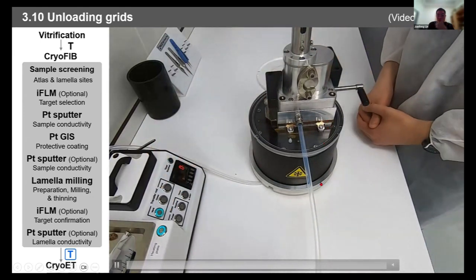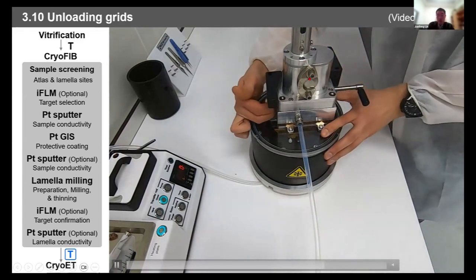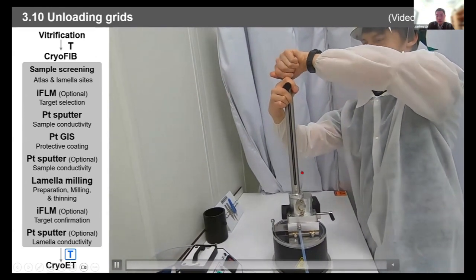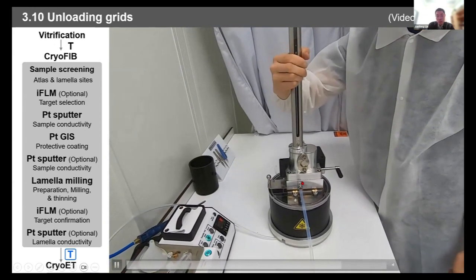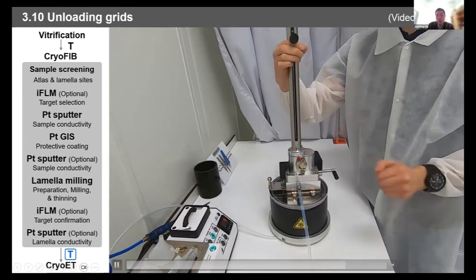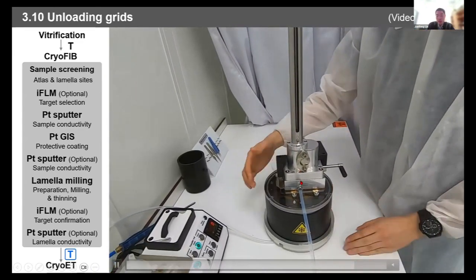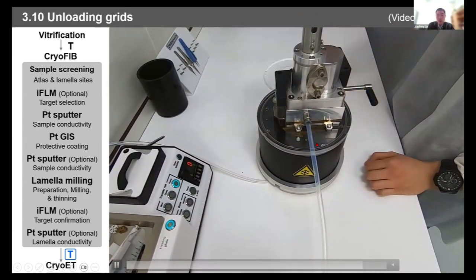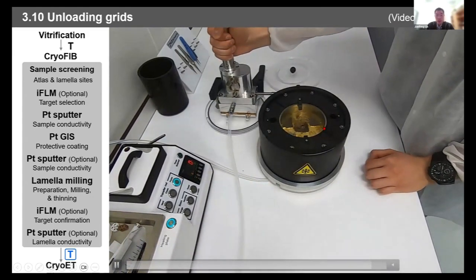After venting, the nitrogen gas will fill up the chamber to keep the chamber moisture free. Even a short time of warm nitrogen gas will not affect your sample, because your sample is protected by a shuttle, still clean and dry and cold. And then you transfer the sample back to the loading station, and now your sample is in liquid nitrogen. It's safe and clean.